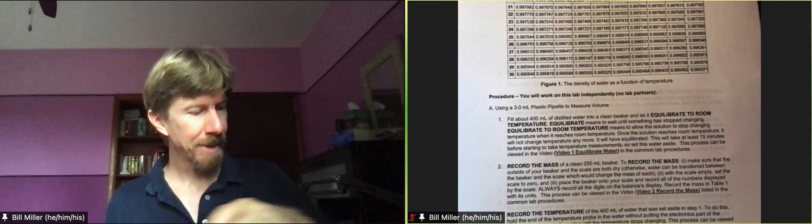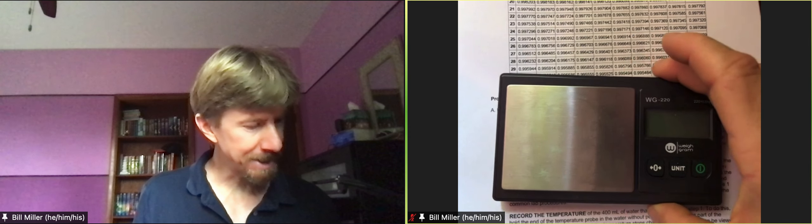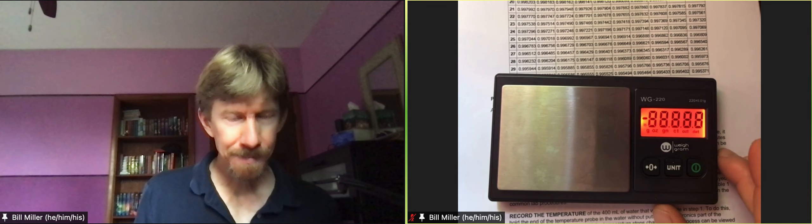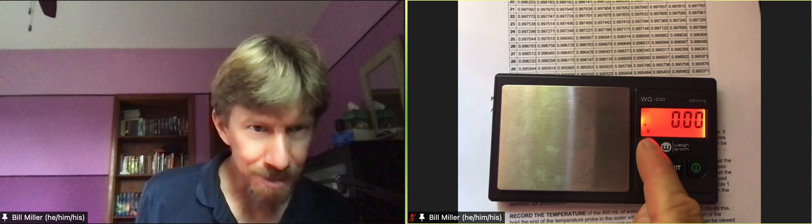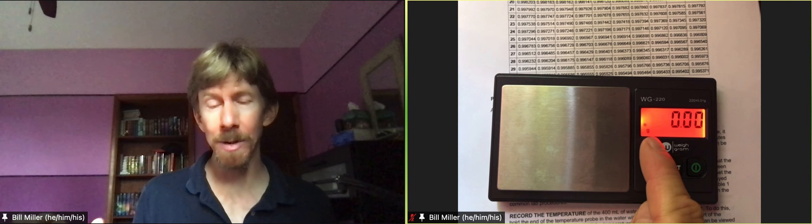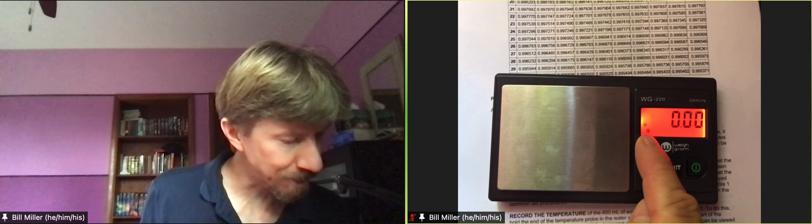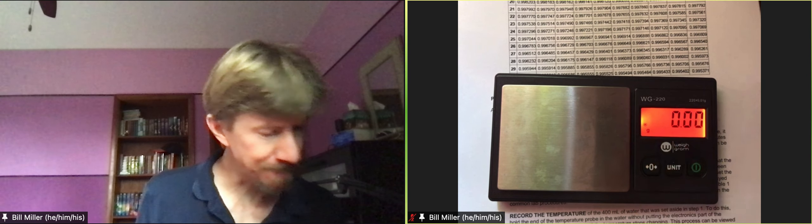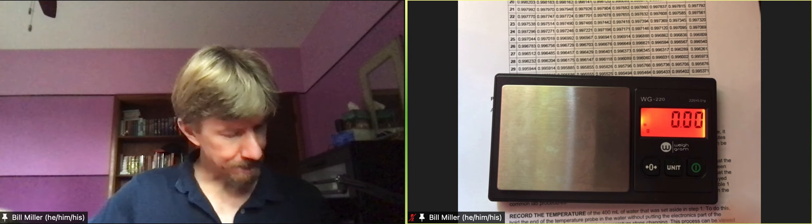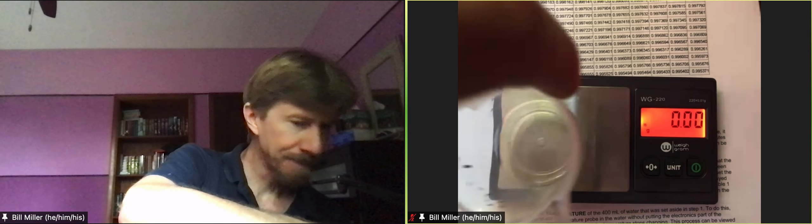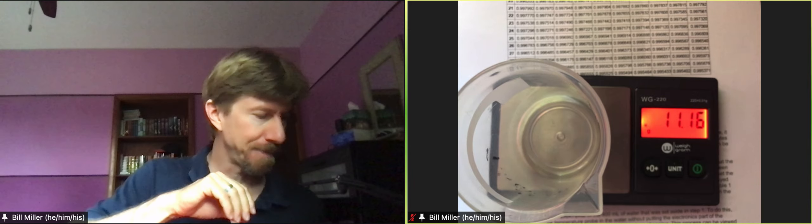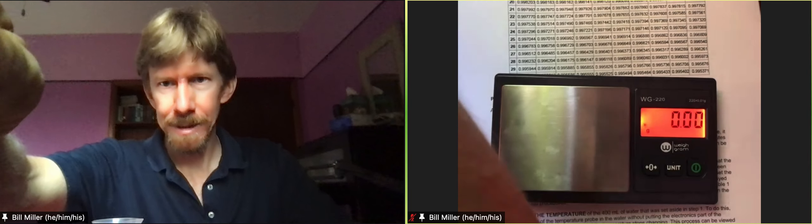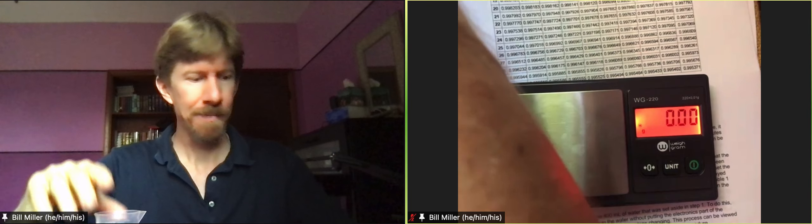With the scale empty set the scale to zero and I can do this here so I'm going to turn my scale on. When it comes on it will say zero and then you're looking at that little circle right there, that means it's set. So you don't want to put anything on until that circle appears, that little circle with a little dot in it. You want to be in grams and then you're going to measure the mass of your 100 milliliter beaker. My 100 milliliter beaker, again wait for the little dot to appear, is 11.16 grams. Yours will likely be different.